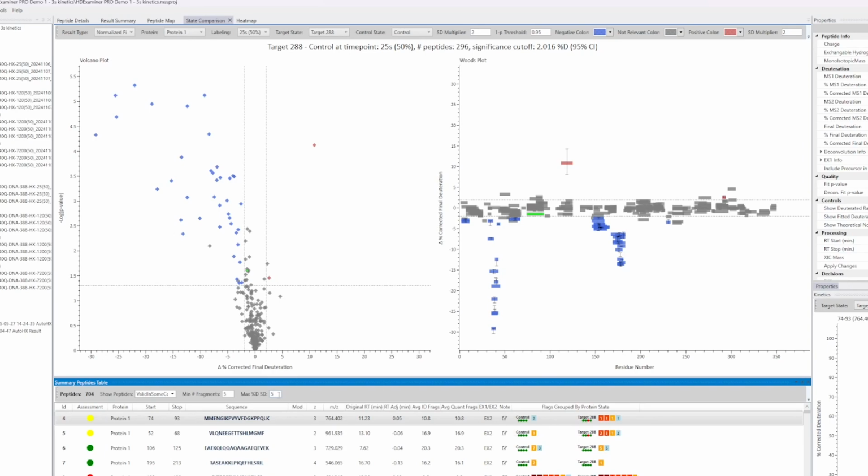And so what I can do is decrease this filter. I say, okay, I can accept a standard deviation per state of 5%. Maybe I want it to be lower. Let's say I want the maximum standard deviation to be 3% for a replicate set. I can set it here. And as before, you see a lot of the outlier peptides have disappeared. So this saves some of the manual work to click on peptides and delete them and so on. You can simply modify these 2 filters.